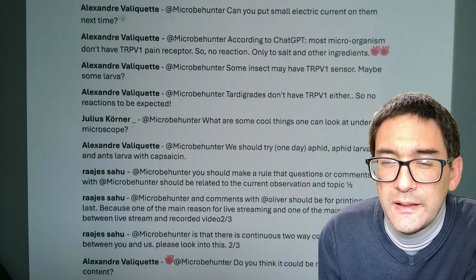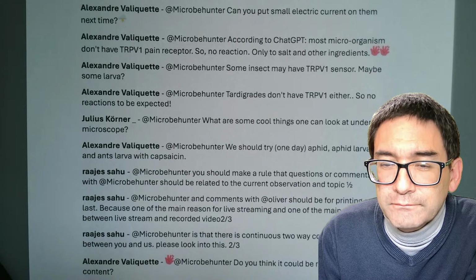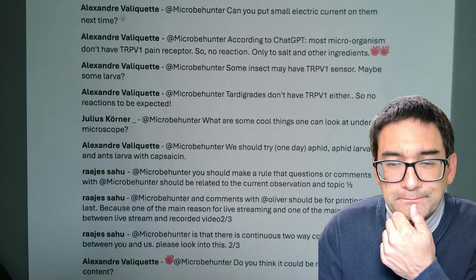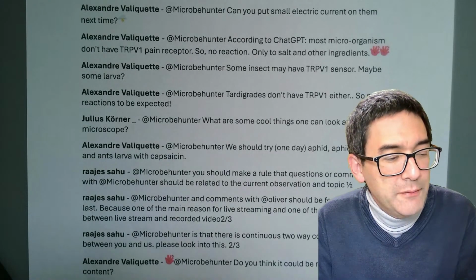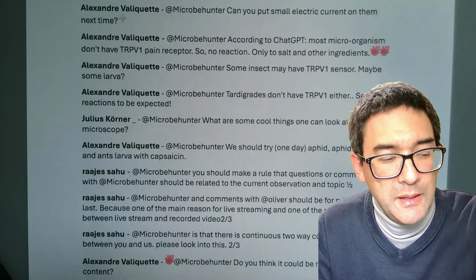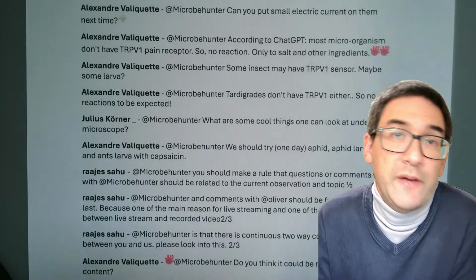Oliver, I can't find any organisms other than Rotifers and Vorticella in the area I've searched. Pond, tree, moss, etc. Do the following. Be patient. Really, for example, what I've done here, those water samples that are collected, I've collected from the same pond, but simply from different areas. I generally suggest that you keep on looking, and if that's what you find, then that's what you find.